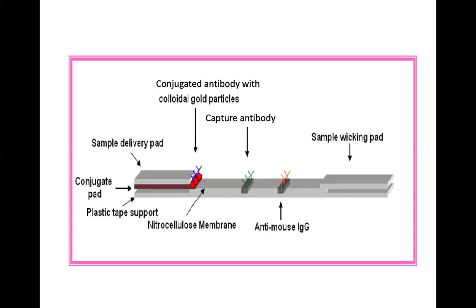Okay. So if you want to study for your own application, I suggest that you buy a different set of nitrocellulose membrane, because they have different pore size, they have different characteristics, and do some characterization before finalizing which nitrocellulose membrane type is suitable for you, because your sample will have some effect on the suitability of your membrane. Okay, so it's not like one formula fits everything.